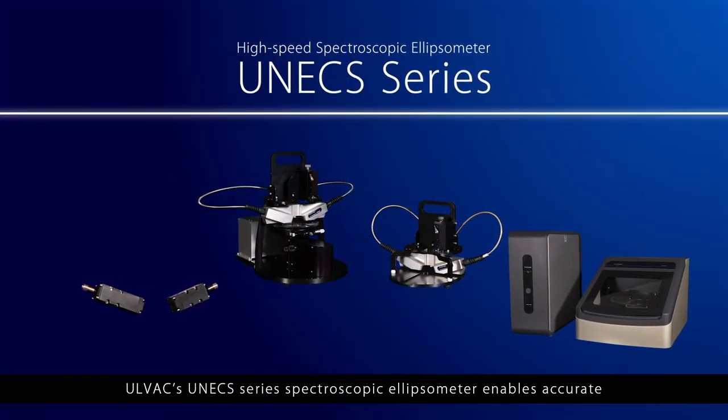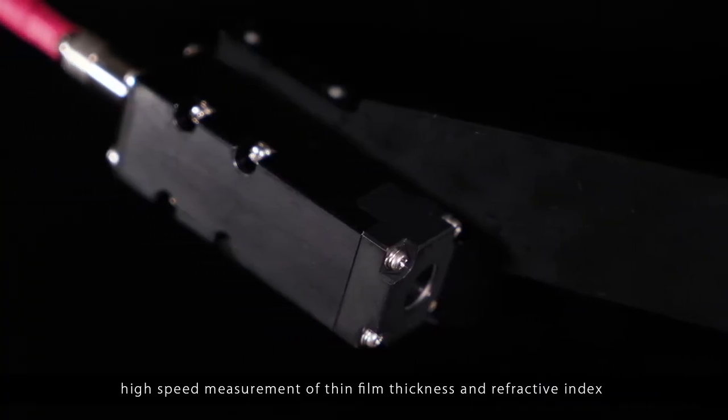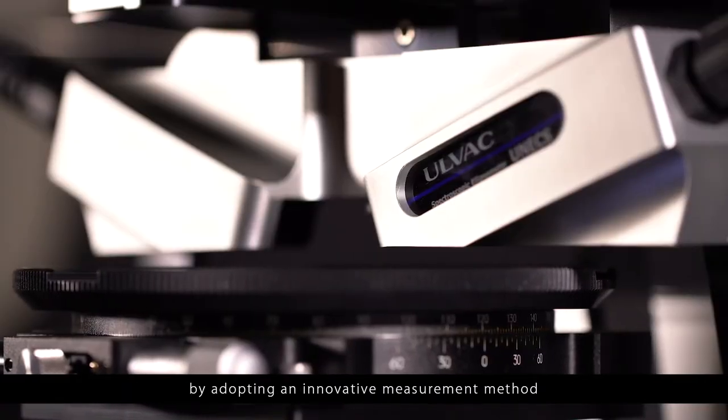ULVAC's UNECS series spectroscopic ellipsometer enables accurate high-speed measurement of thin film thickness and refractive index by adopting an innovative measurement method.